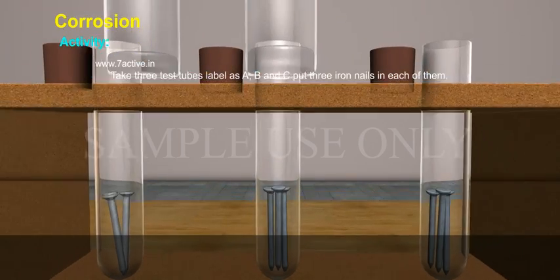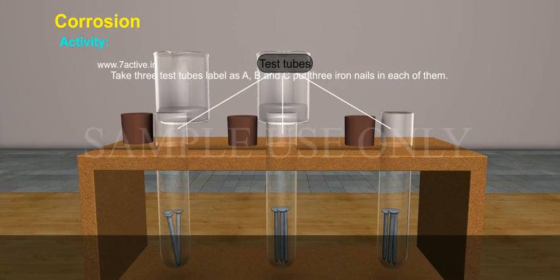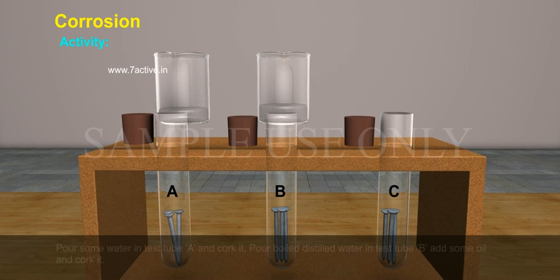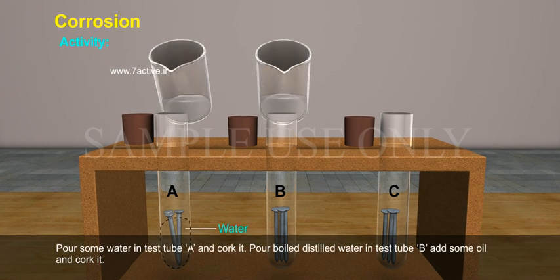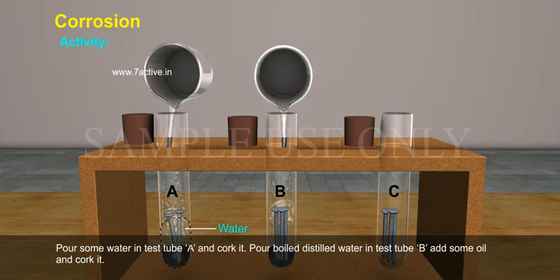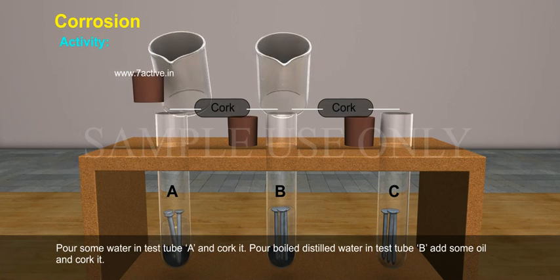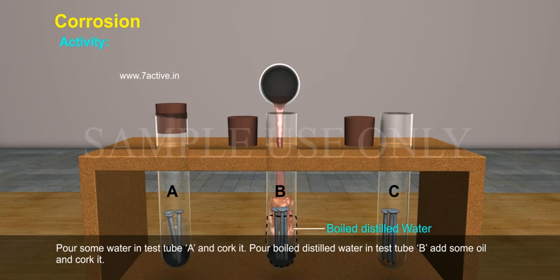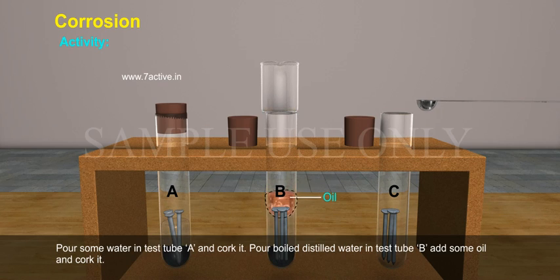Activity: Take three test tubes labeled as A, B, and C. Put three iron nails in each of them. Pour some water in test tube A and cork it. Pour boiled distilled water in test tube B, add some oil and cork it.